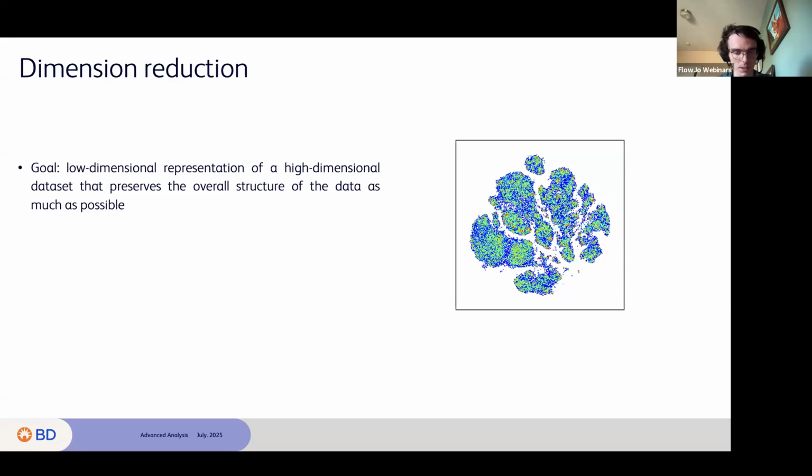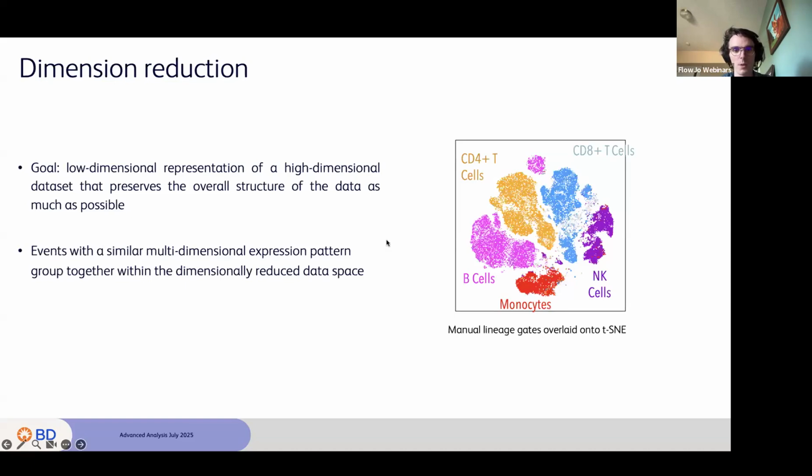It's going to be similar to clustering. We would expect our clusters to be split up similar to the islands that we see here in this t-SNE plot. But the visual representation we see here is mostly for visual purposes. So again, the goal with the t-SNE plot is to separate the data and visualize it based on its different phenotypes.